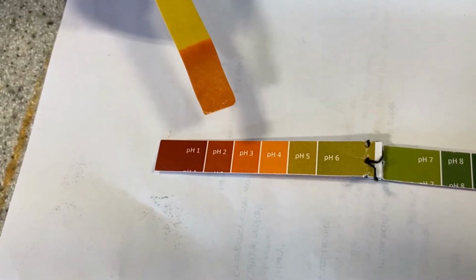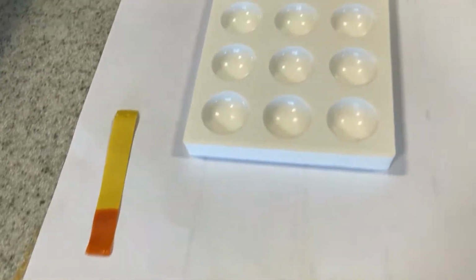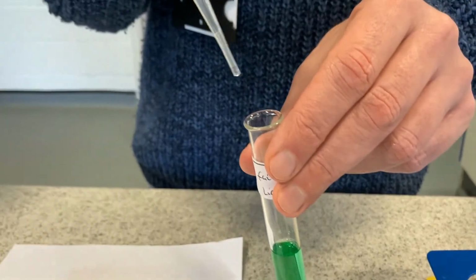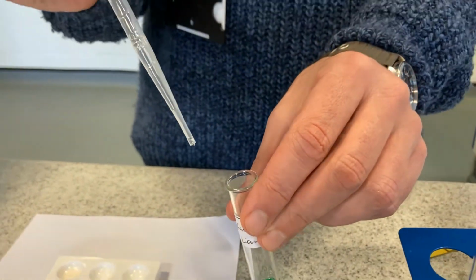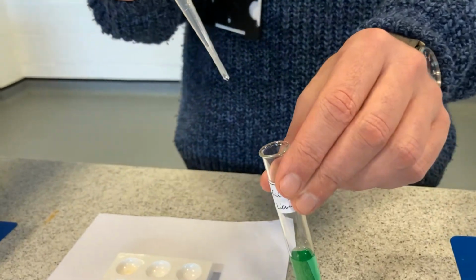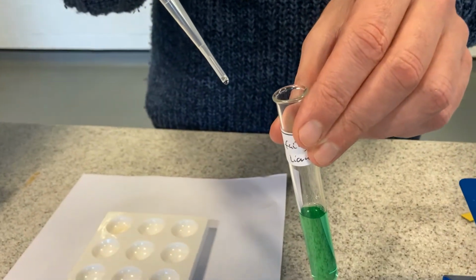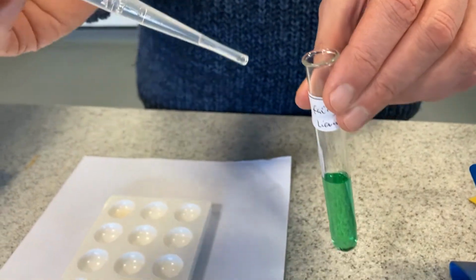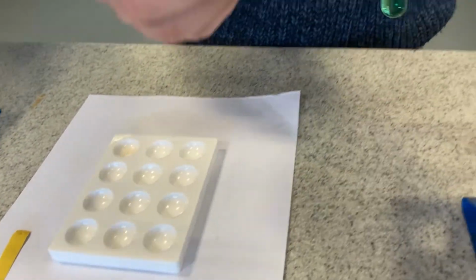Okay, so I'll just get my next one. Oh, Miss Hunt. Emergency! We have reached an error! Mr. Crawshaw, are you using the pipette from the vinegar in the washing up liquid? I think you're right. Yes, I have actually got some vinegar in there, so that's no good. I must get a clean one.